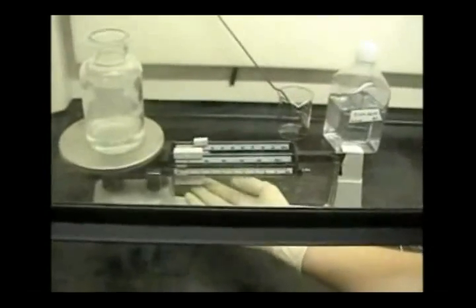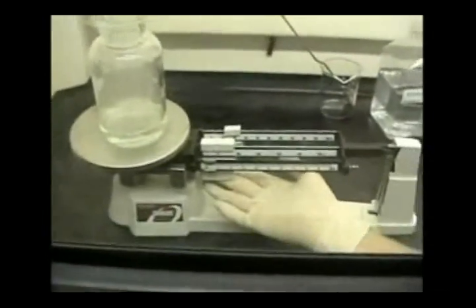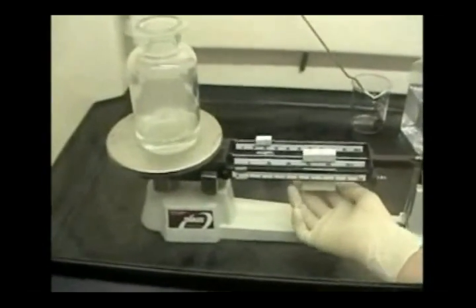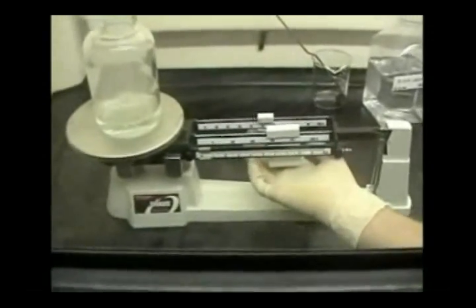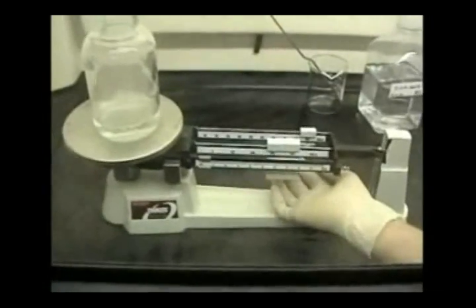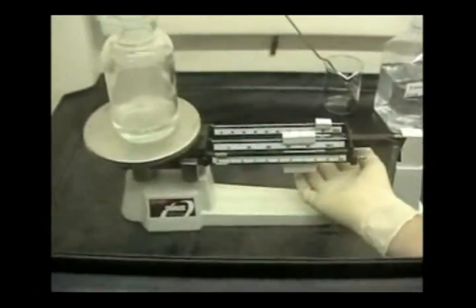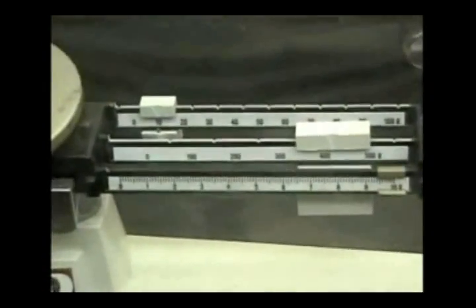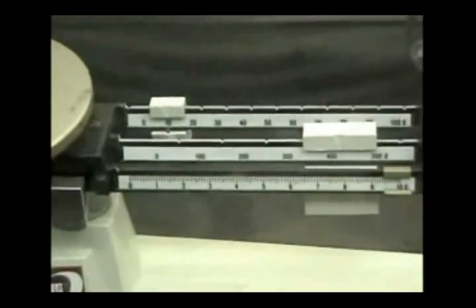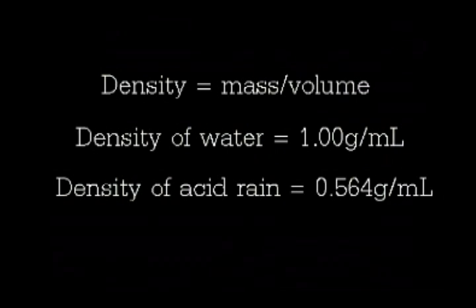We are now taking the mass of the glass bottle, cover glass, and the acid rain together. The total mass is 419.9 grams. In order to get the density, we subtracted the mass of the glass bottle from the total mass and divided by 15 milliliters.